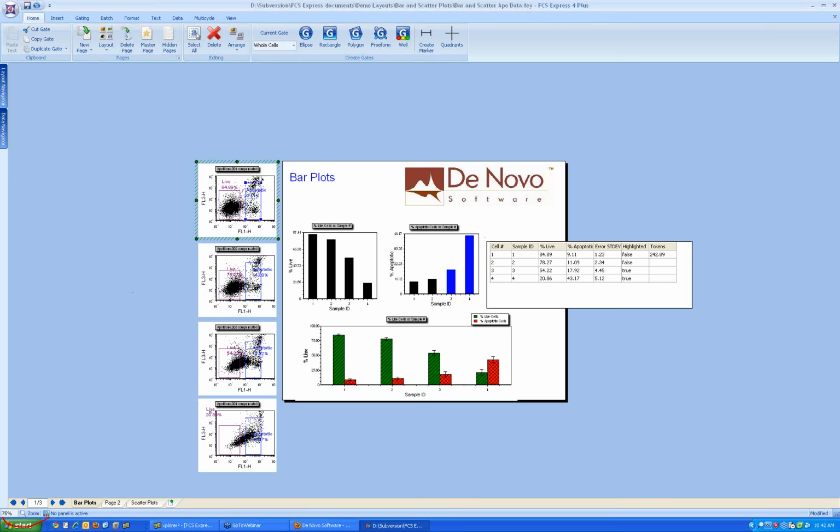You notice how they change to blue. They change to blue because you can actually specify a criteria when a bar should be highlighted, and you can specify what the highlight color is. So if a bar meets a certain criteria, and you decide what the criteria is, and you build that with tokens, the bar will automatically change to the highlight color.